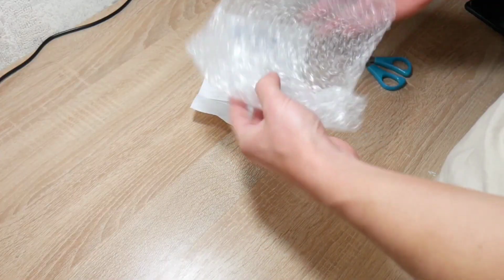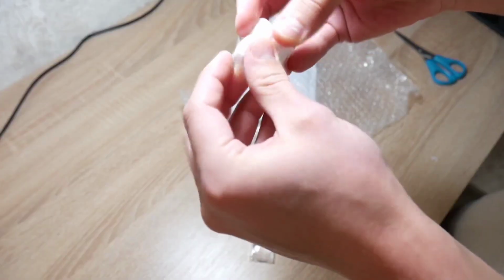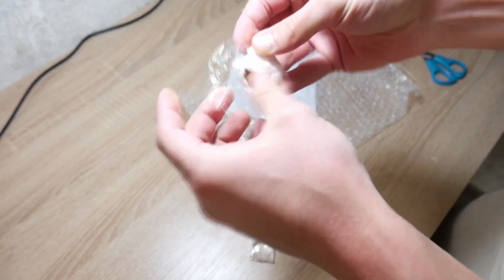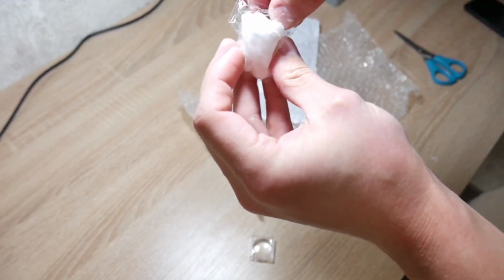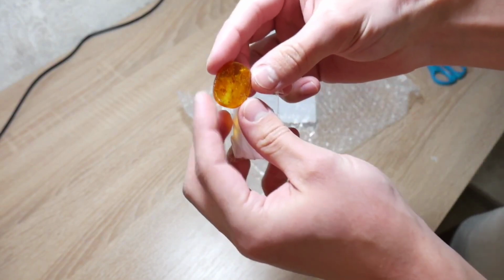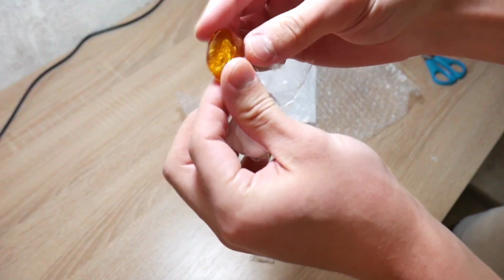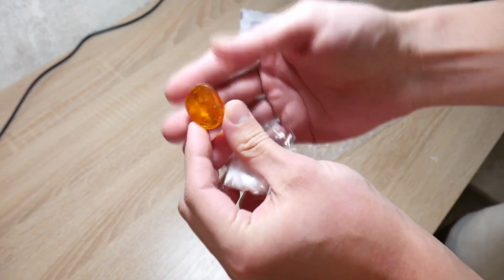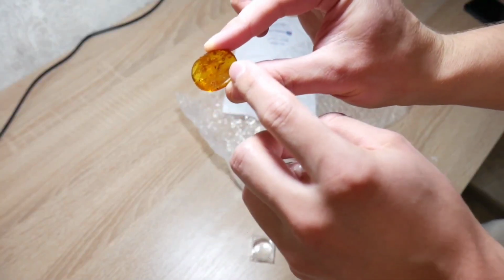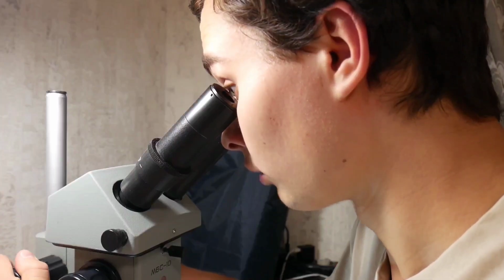Recently I received such a package from the Amber Village, named after the settlement. I think it's clear that it certainly contains amber, but amber that is quite unusual. Amber is popular among jewelers because it is used to make beads and other jewelry, but for biologists and paleoentomologists it is attractive for another unique feature that we will talk about now. Look what a beauty. But the most interesting thing is waiting inside this amber. It is not the pebble itself. The most interesting thing is here, and now we will look at it under a microscope.